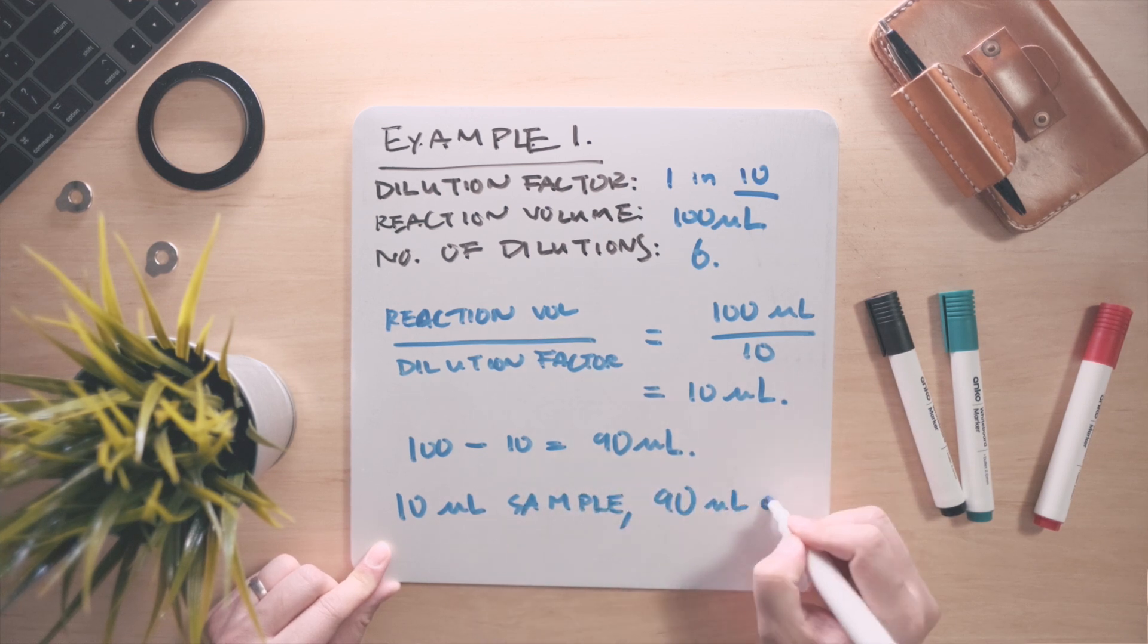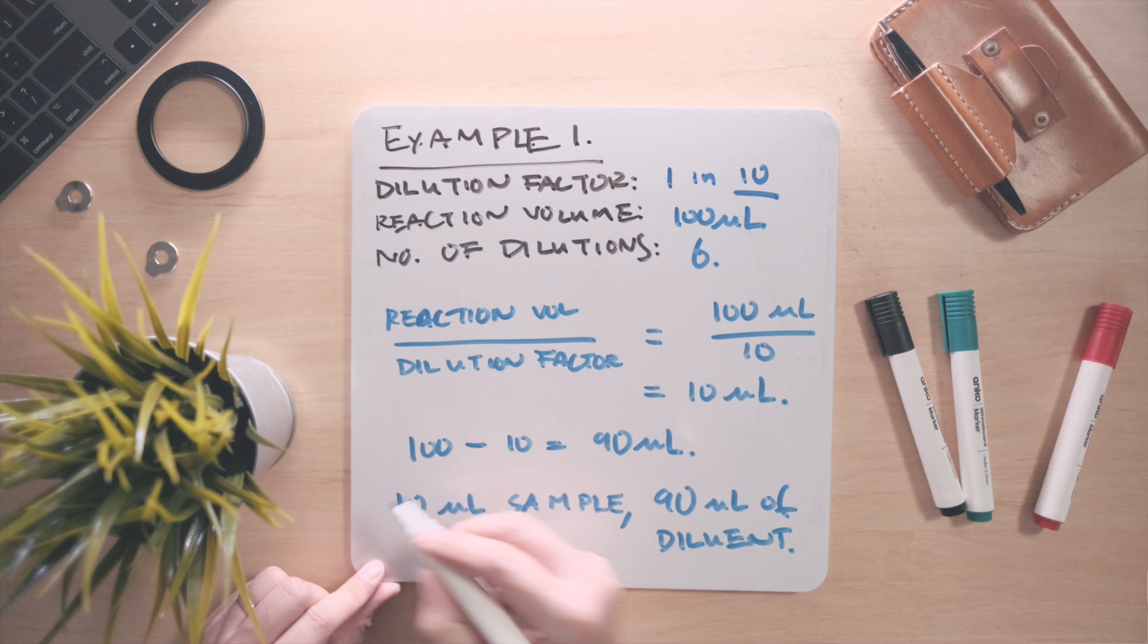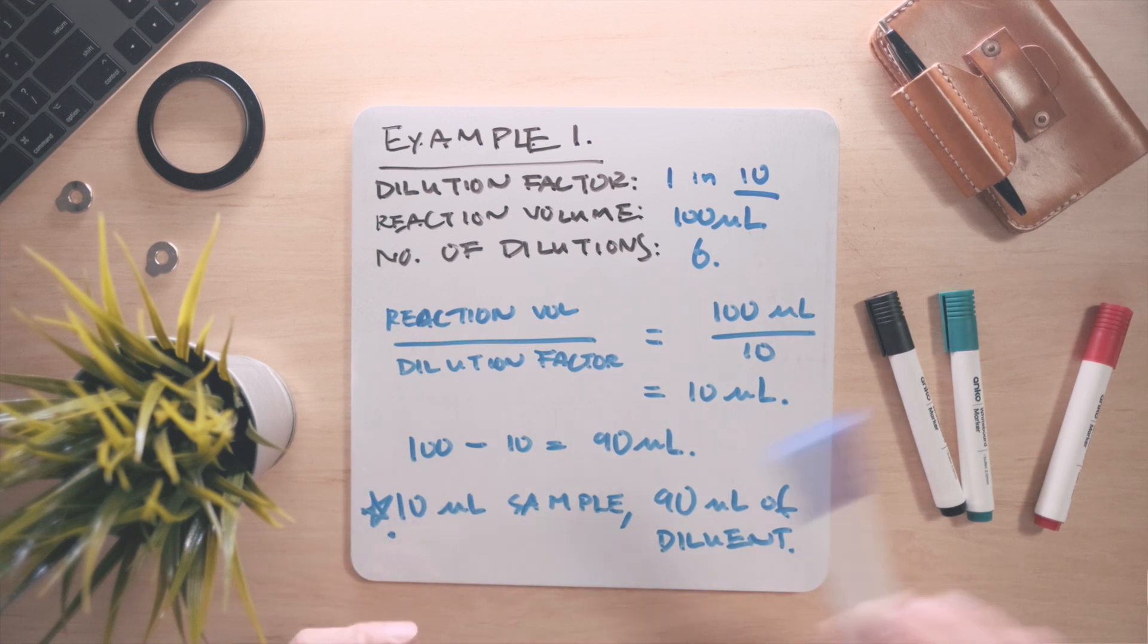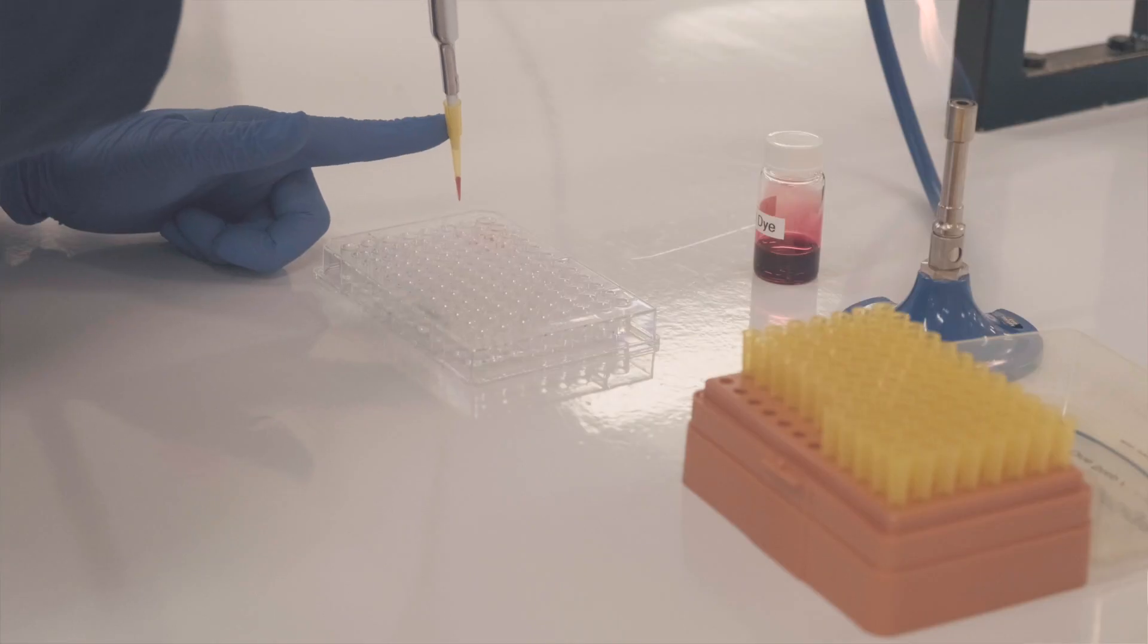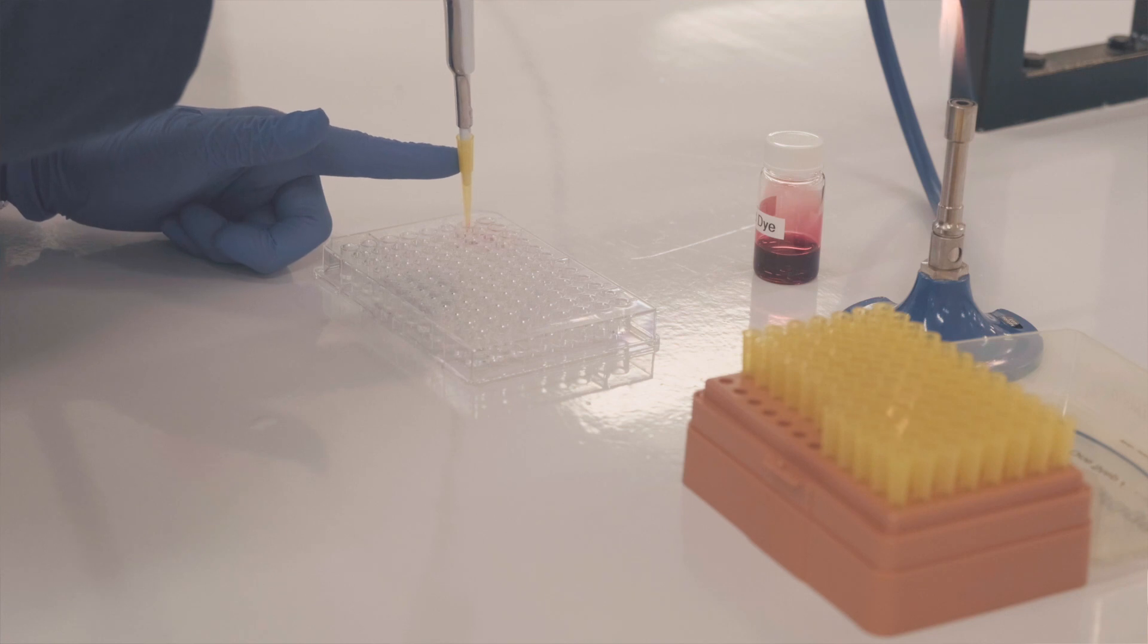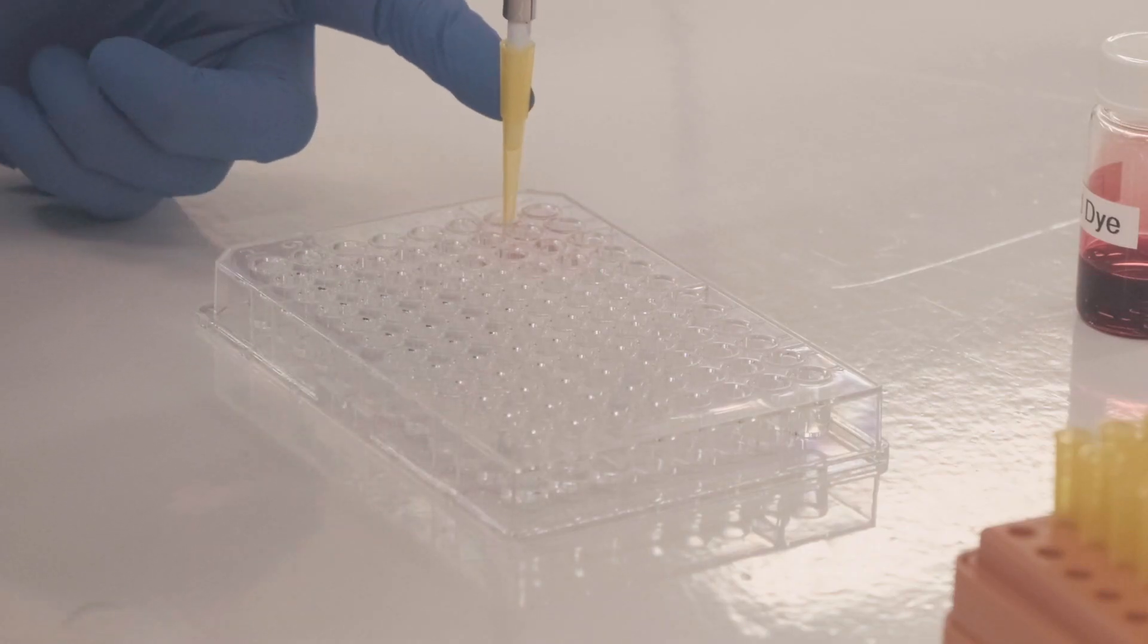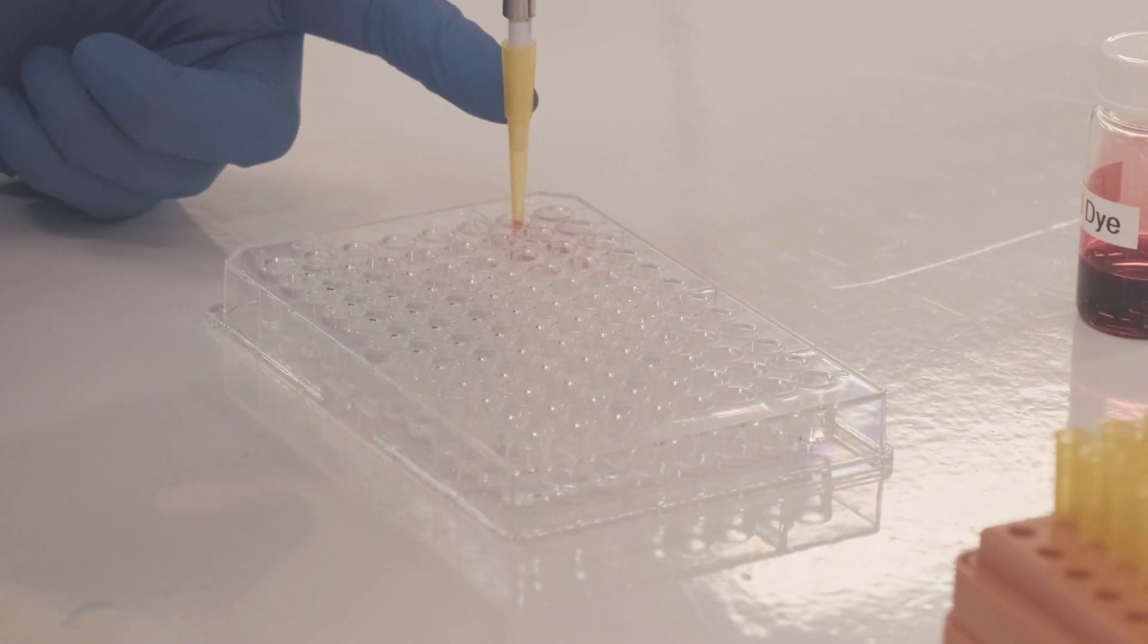Given that there are six dilutions in total, add 90 microliters of water to six wells in the plate. Then pipette 10 microliters of the food dye and add this to the first well. This is the first 1 in 10 dilution, and now this well has 100 microliters of reaction volume. The reaction needs to be thoroughly mixed, and you can do this by pipetting up and down a number of times.